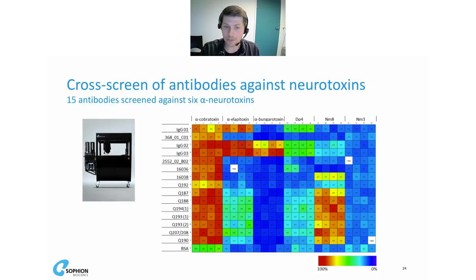But when you look at the venom profile from the snakes, each snake species' venom profile consists of several dozens of different toxins. When you're being bitten by a snake, you rarely recognize what species bit you, or you often don't see the snake at all. Therefore, it's also highly desired to have cross-reactivity of these antibodies. And for this, we use the Qube to evaluate.